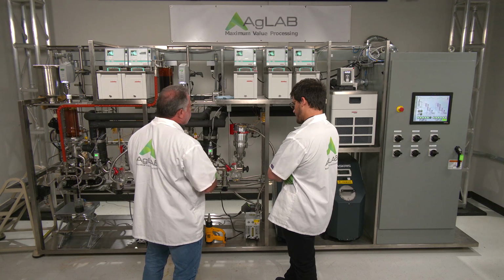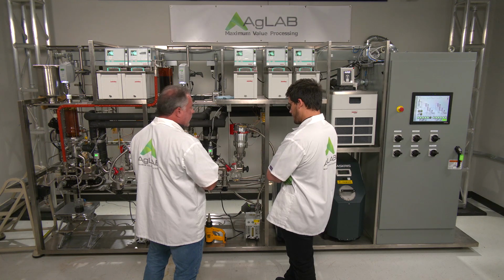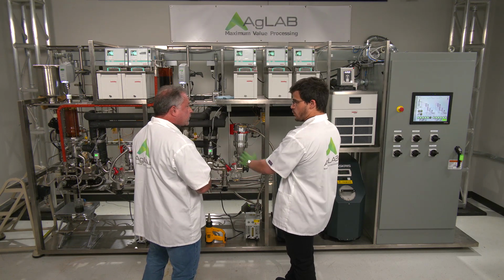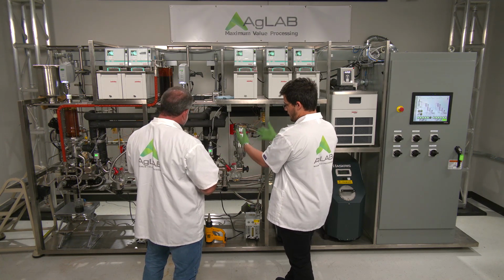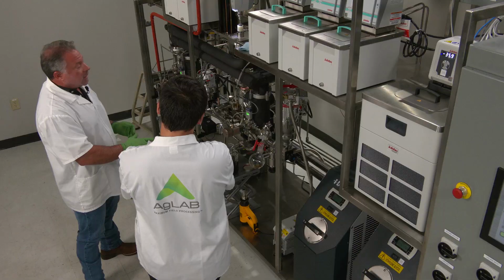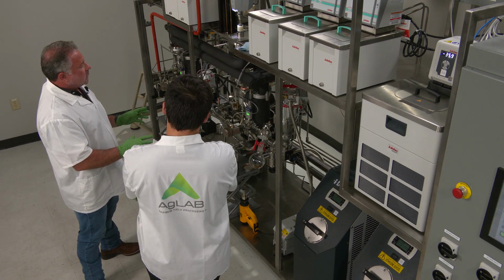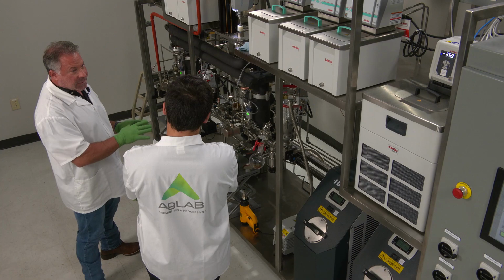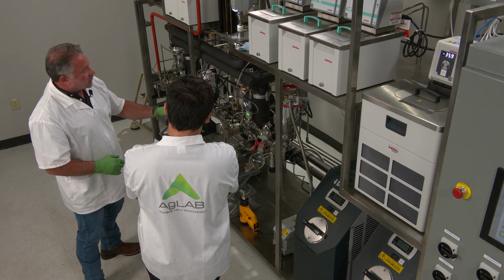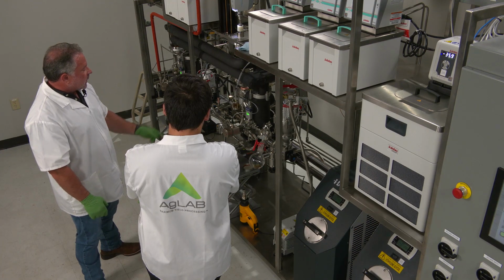For CBD, it's generally 80 to 90. THC, it's above 90. Okay. One of the things, if you had a bad stage 1 strip, that's going to show up poorly in your potency. It's going to show up over here because we don't have as good a vacuum. One of the key features to this type of distillation is how good your vacuum is and how well you control your vacuum. Okay. So let's go ahead and take a sample here.